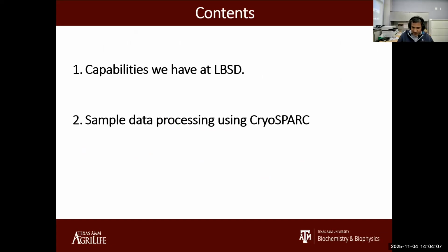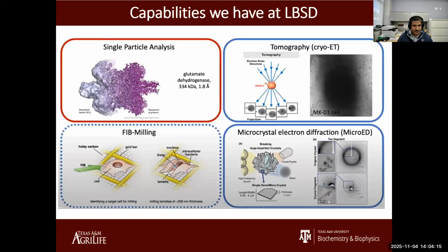So first, I want to tell you a little bit about what we have here at the Laboratory, LBSD. And if you have any interest in using our resources to collect cryo-EM data, we can help you do that. We have all four different capabilities of cryo-EM. We can do single particle analysis. We can also do tomography.